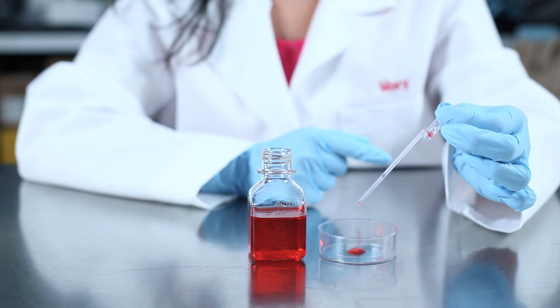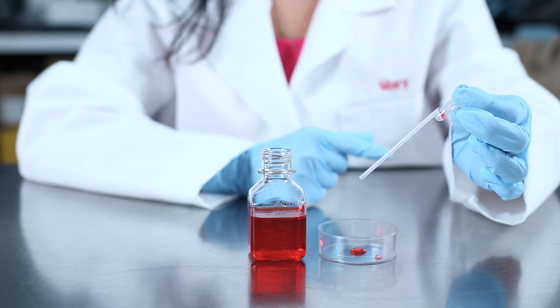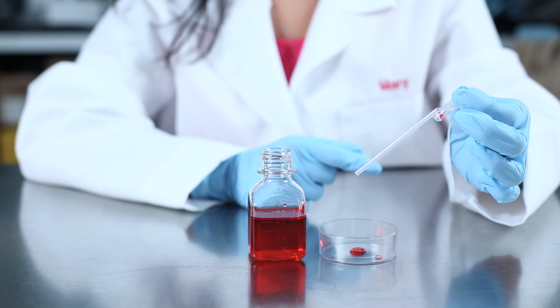Then, simply squeeze the top bulb again to release 250 microliters of liquid. Some residual liquid will remain in the stem. This is normal.